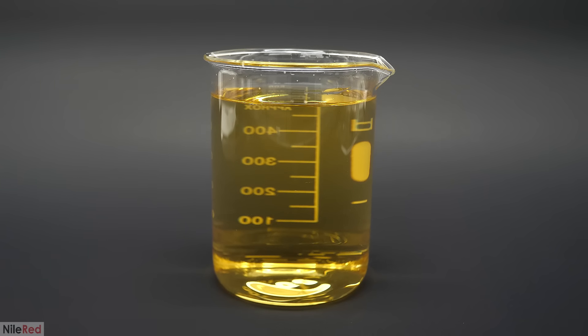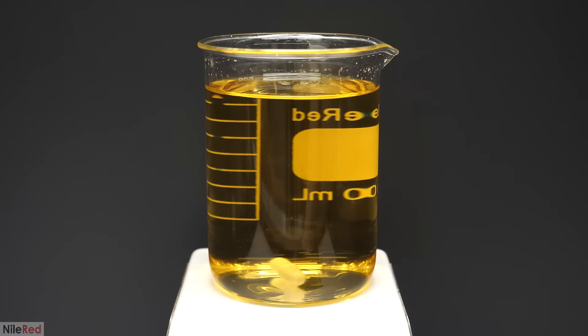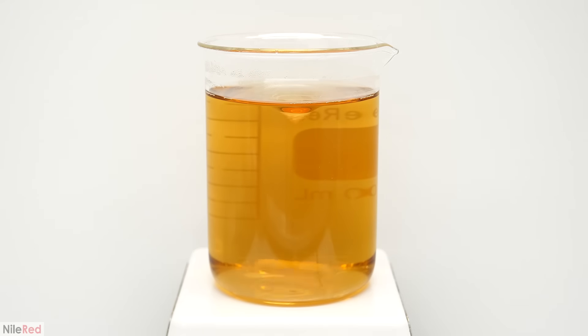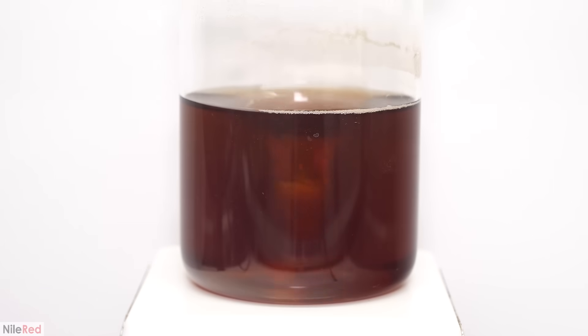So what I decided to do instead was to just throw it on a hot plate and evaporate off all the water. After heating it for several minutes, the color started changing and it became kind of brown, so I swapped it for a nicer white background. Over the next couple hours, all the water disappeared, and I was left with an almost dry powder.